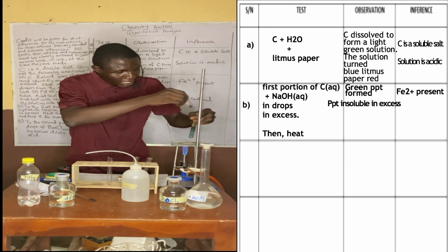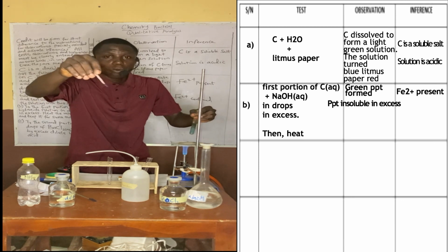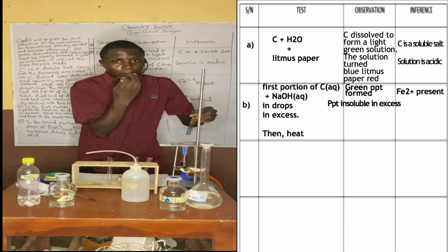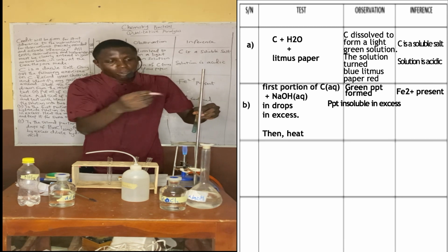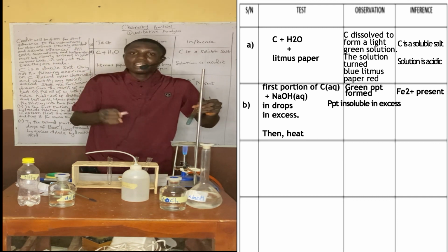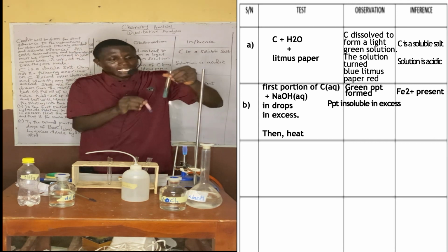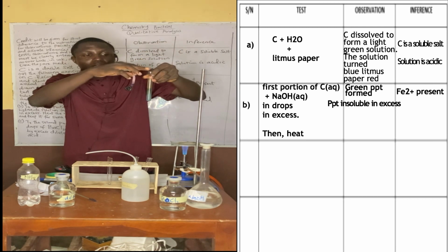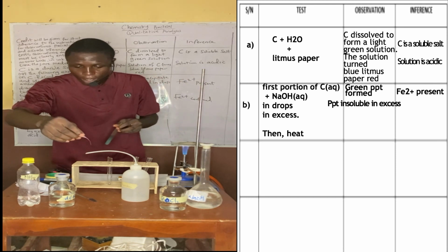Meaning that the gas that is evolving here is a basic gas, and there's an irritating, shocking odor that I'm perceiving, indicating that there is the presence of only one gas that has a shocking, pungent, irritating smell. That is ammonia from ammonium ion. So meaning that ammonium is present in this concentration. That's why we can perceive ammonia gas being evolved.